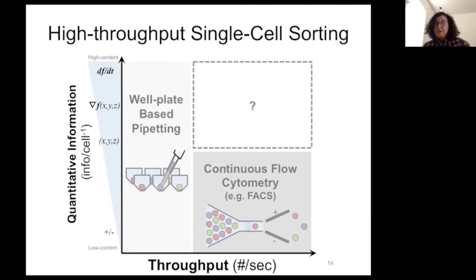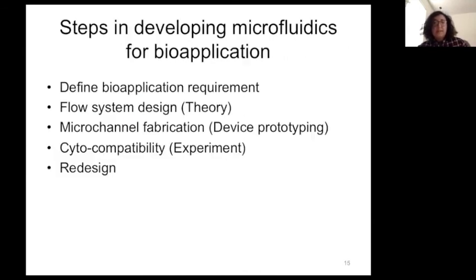But with microfluidics, you can actually flow a huge number of cells, a million, a billion cells in the channel and process them in a nanoliter, right? So this is why microfluidics steps in and really increases the throughput of single cell sorting and analysis. And this is the way to go. If you want to increase any sort of assays, you have to go to microfluidics, especially for cells, protein, DNA, RNA, which is at this scale.